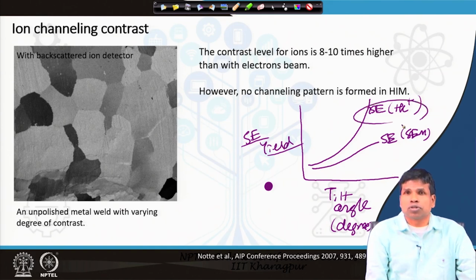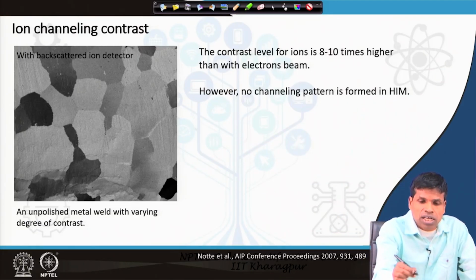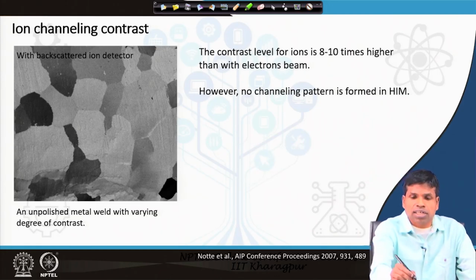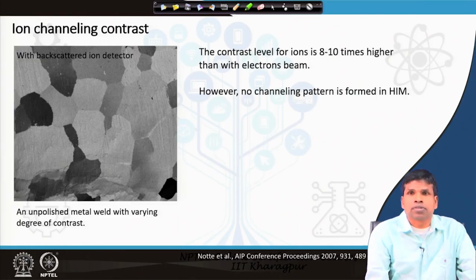This is what we have also discussed in the last couple of classes. So, these are the important points that make the helium ion microscope much superior to the scanning electron microscope. In our next lecture, we will discuss a little more about contrast, and today we stop here. Thank you.